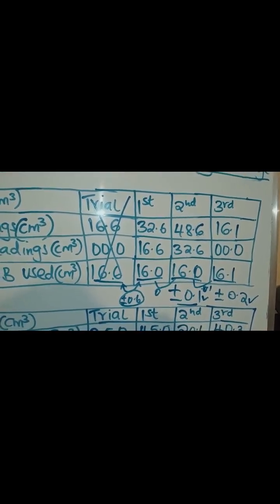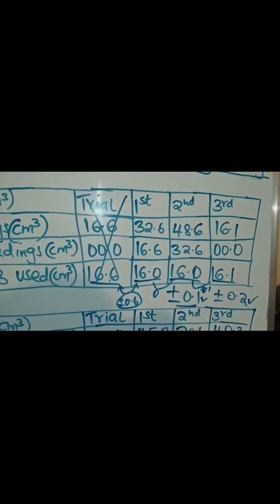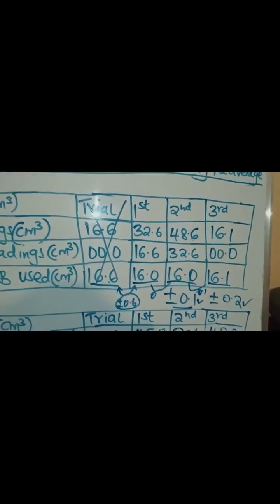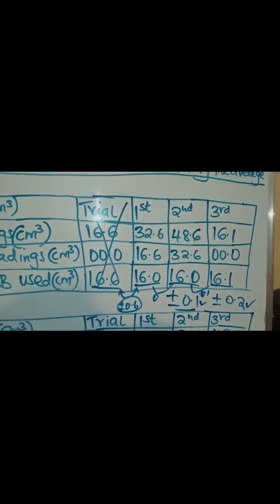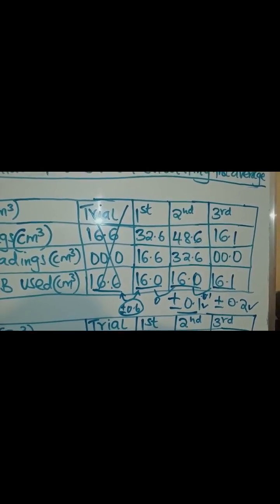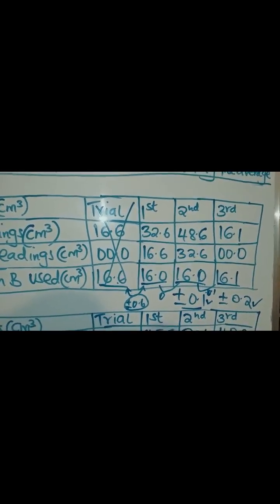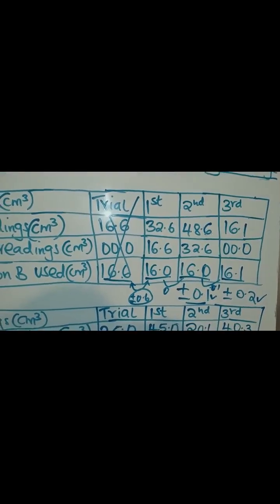If only one value was to be taken, because there comes a time when you have done the titration, you get different values. All of them are different from one to the other, and all of them have got a bigger difference from one value to the other. So you get confused, and it is during K.C.S.E and time is gone. So you only take that value that according to you was very accurate in the manner that you did the titration.